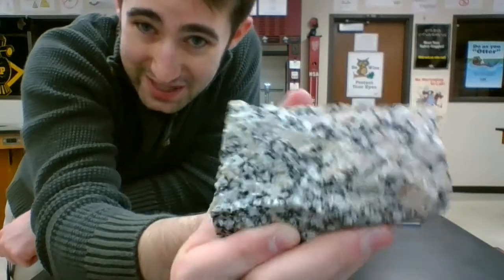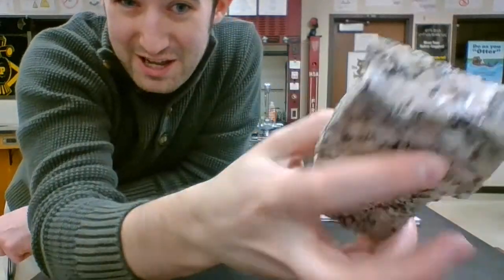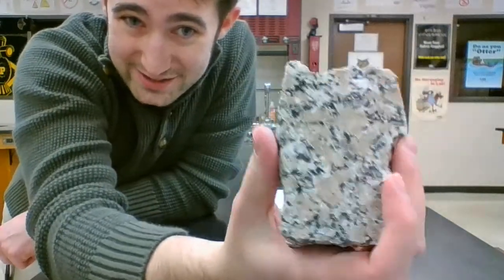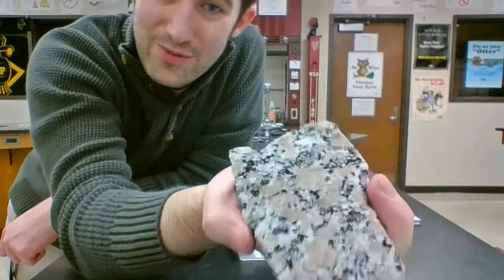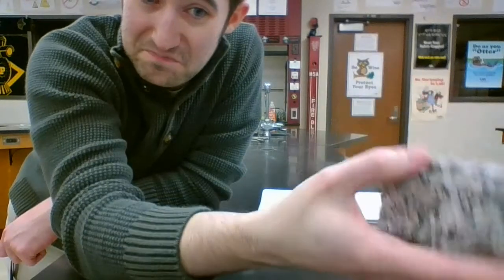Okay, now just at a first glance, you can tell this is a mixture. Also, because you can just look at it and tell this is a mixture, you can tell it's a specific type of mixture. So, what is this, a homogeneous or a heterogeneous mixture?